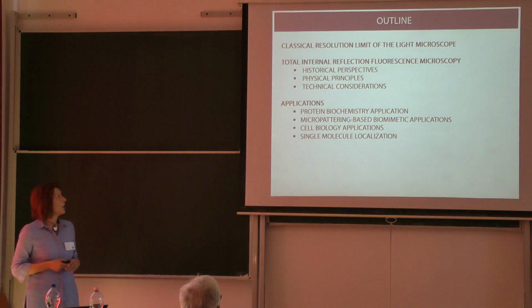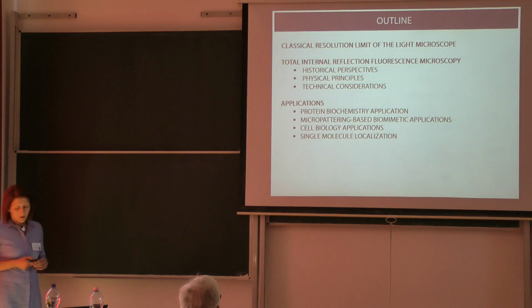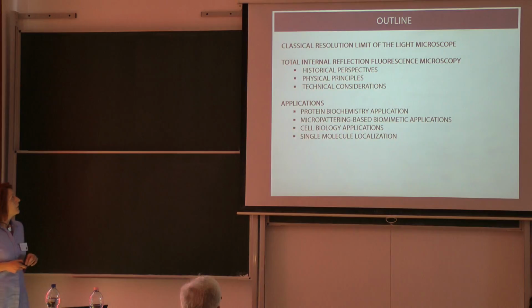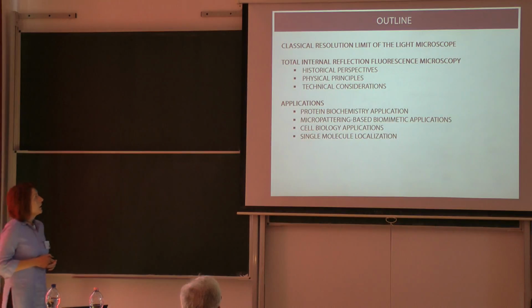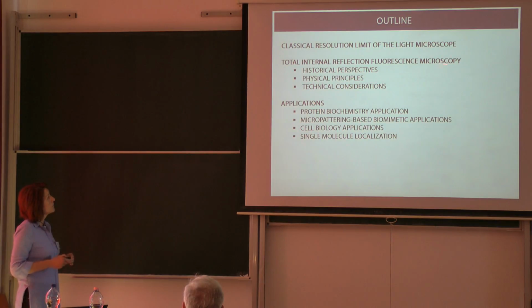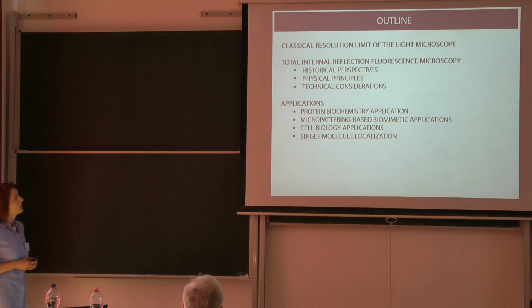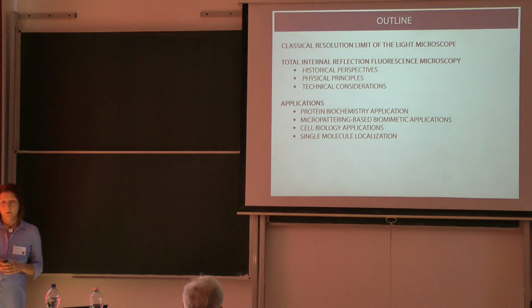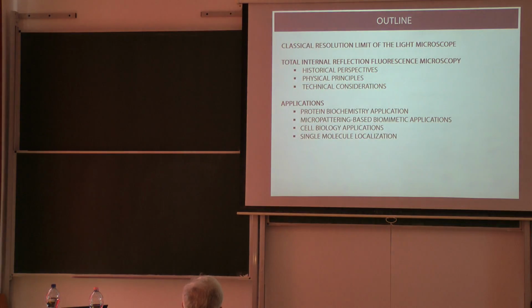Okay, so to give an outline of my talk, first of all I would like to briefly explain the rationale for developing these so-called super resolution microscopy techniques by briefly discussing the classical resolution limit of light microscopes. Then I will introduce in detail total internal reflection fluorescence microscopy, or TIRF microscopy, with some historical perspectives, as well as the physical principles and some technical considerations that you have to think of when you want to use this technique maybe for your own research.